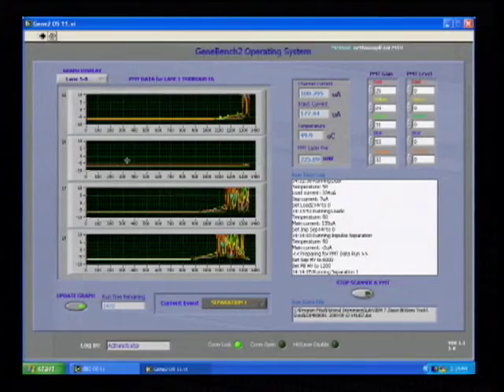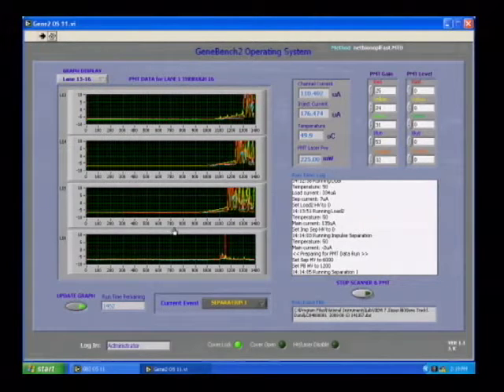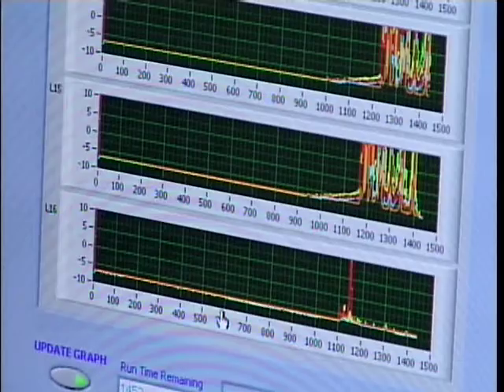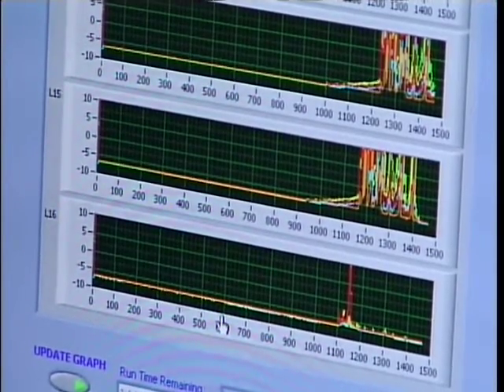For lane six we do not see a primer because allelic ladder has been loaded there. Similarly, lane 16 shows no primer because a matrix standard has been loaded in that lane. Having 16 lanes allows one to include positive controls, PCR controls, negatives, allelic ladders, and a large number of samples for simultaneous analysis.